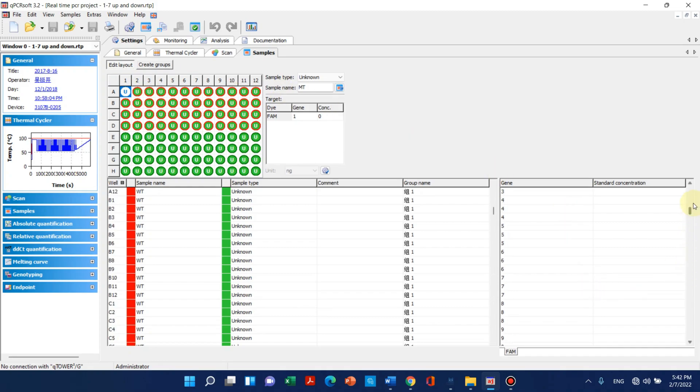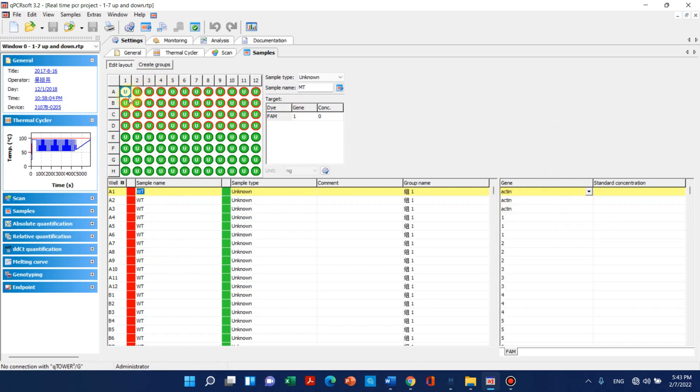Here I can show you the first three were actually the housekeeping gene, that is actin, so I have named them as ACT and you can name them according to your choice. Here I can show you some other features. This software is now showing one completed qPCR cycle of my samples.